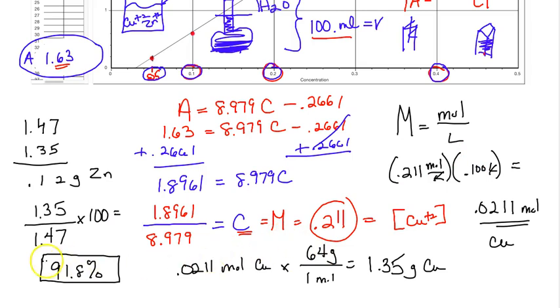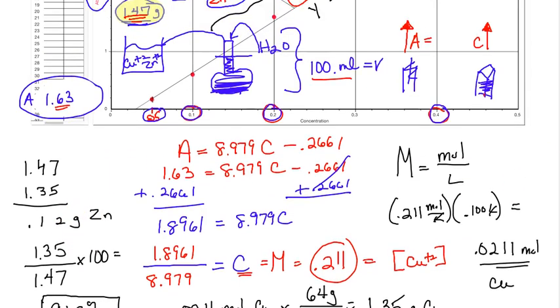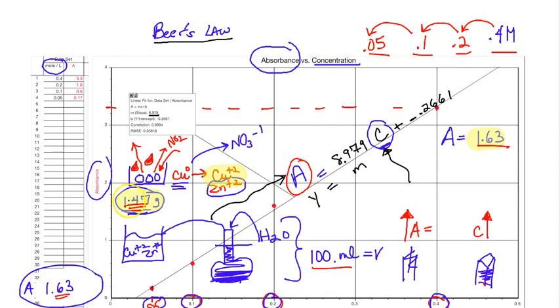But you should be able to understand that we were able to do analysis of the alloy, of one of the components of the alloy, by using the idea of crystal field splitting and color, and of course a spectrophotometer, which takes into account the idea that a more concentrated colored solution is going to have more absorbance than one that's lighter. Hope that helped.